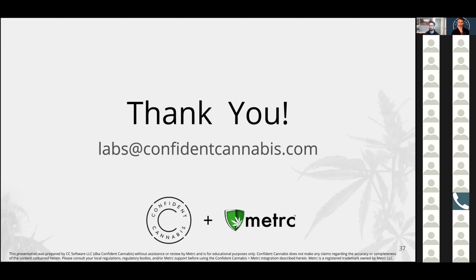Yeah, we have one that came in from Jessica. It was to clarify, if a client drops off their own sample and we do not realize the weight is incorrect until after they have left, would you recommend we just cancel the order we took and replace it with a new order when the client brings in a new sample? To which I replied, with this scenario, we recommend having the client cancel the transfer and re-enter the product in Metrc with the correct weight.